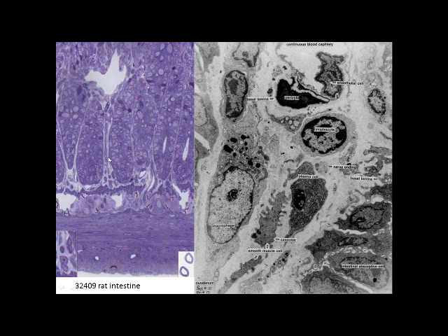This is also smooth muscle cells in through there. But if you look at the interstitium in between, right in through here, so-called lamina propria, then you will see there's a macrophage in here. You see at the ultrastructural level, we can see where it's already eating up things and debris. There's a capillary, so this is the endothelial cell that we see there, very thin. There's a lymphocyte, another lymphocyte over here. This is a plasma cell that produces antibodies.